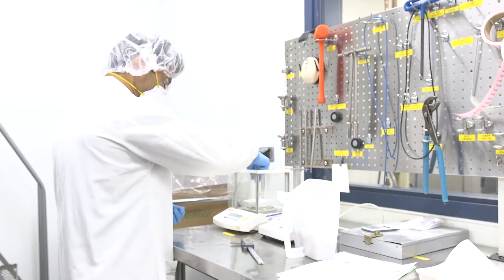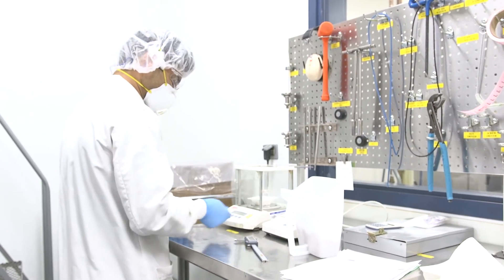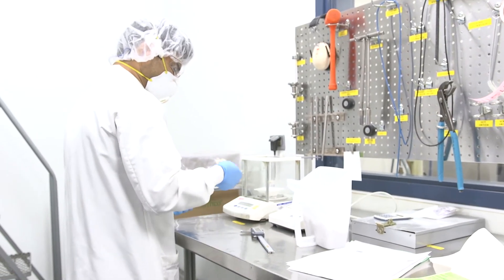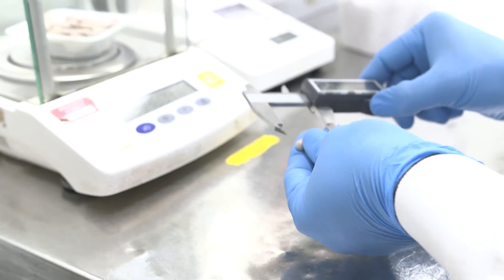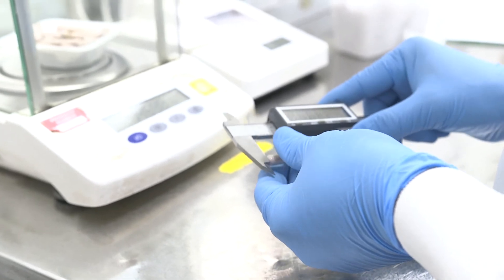The operators are using statistical process control. They have weights that they have to stay between, a high and a low end weight, and so every hour they're pulling samples and checking to make sure that they're within those weights. QC will also go in and do independent checks on the weights to make sure that the capsules are closed, to make sure that the weights are within the prescribed range. And at that point the material is then boxed up and it's moved over to our packaging line.